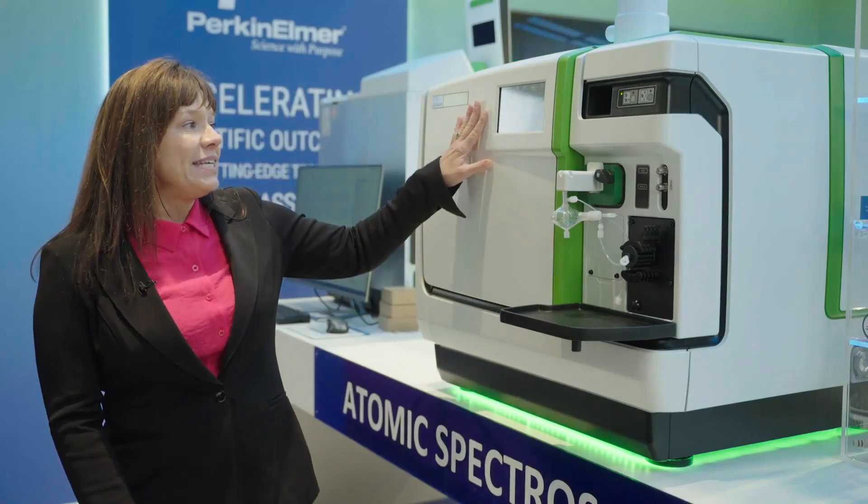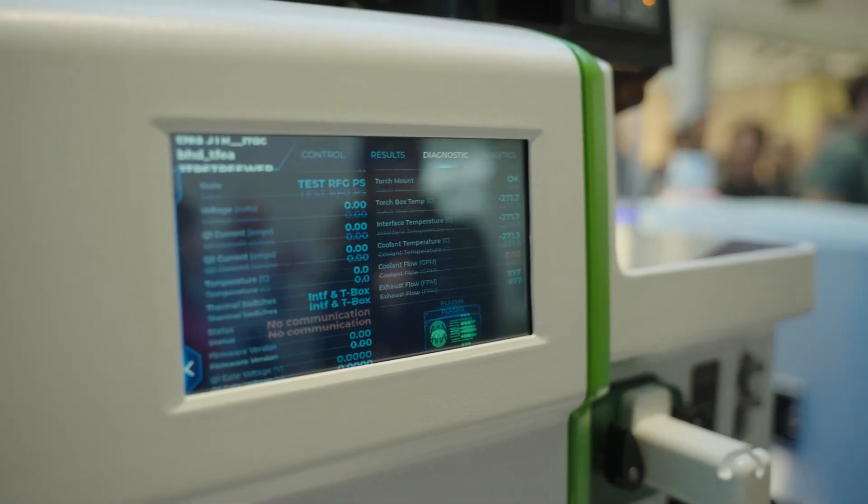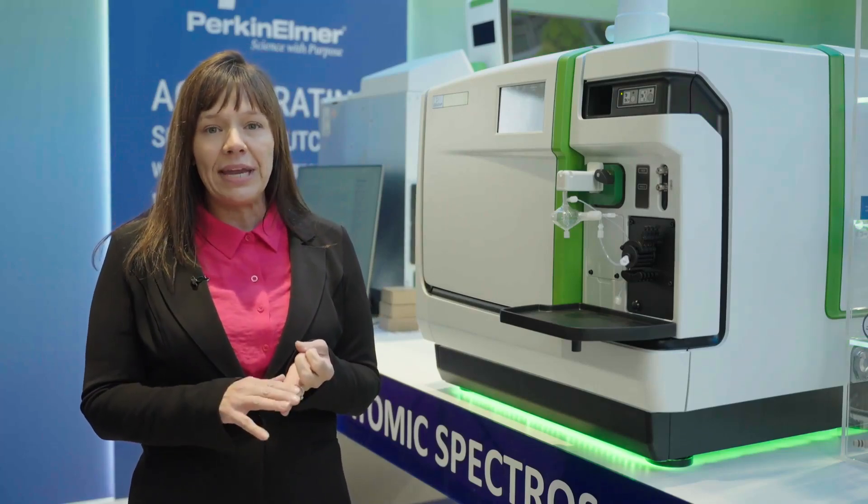The second thing we did is put an LCD screen in the Nexion 1100. What this provides you is real-time diagnostics, and it provides what I would call maybe the most important feature, which is training videos.